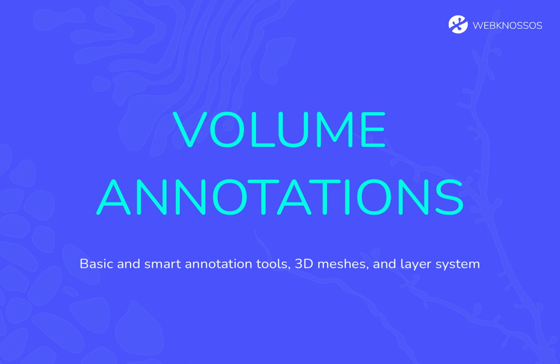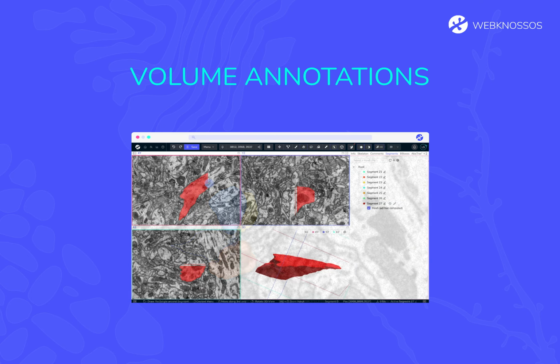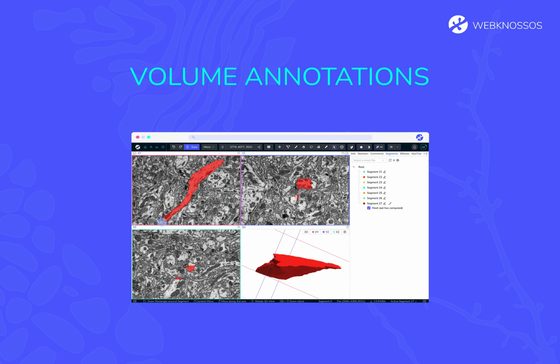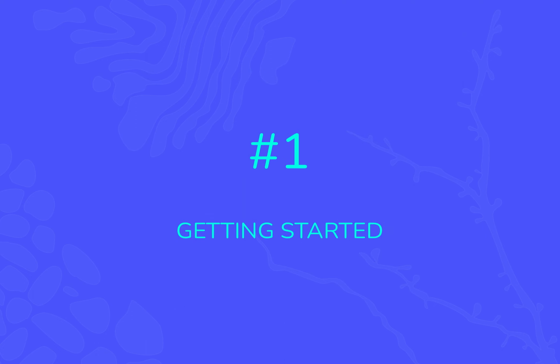WEBKNOSSOS is a great tool for collaboratively annotating large 3D images. In this video, we will show you how to make the most out of the basic and smart annotation tools of WEBKNOSSOS, along with its mesh capabilities and layer system.